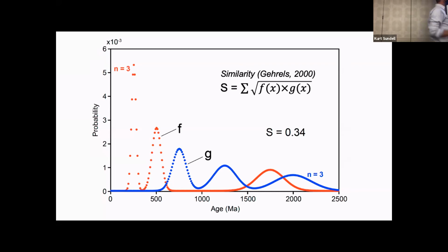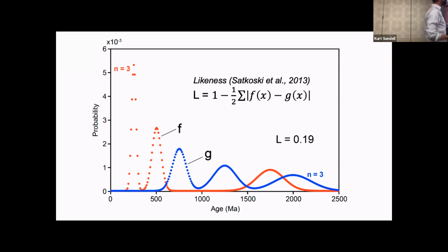So you can imagine if you pull the whole Geochron database and compare everything to everything, you don't want to look at every single plot, right? This would be a way to tell a computer, hey, compare these 50 samples with these other 50 samples, which is exactly what we're going to do in DZ stats. So that's one way. Likeness is another way.